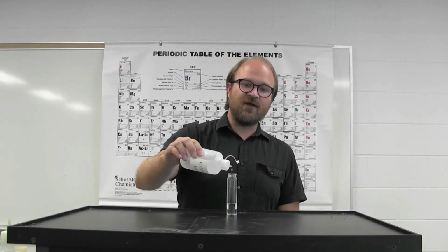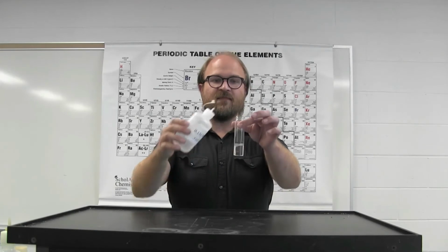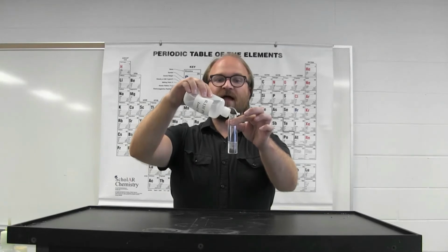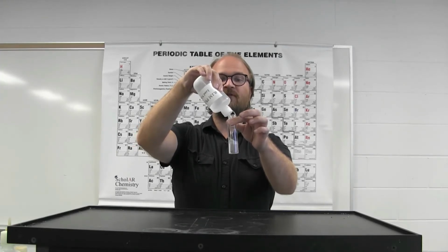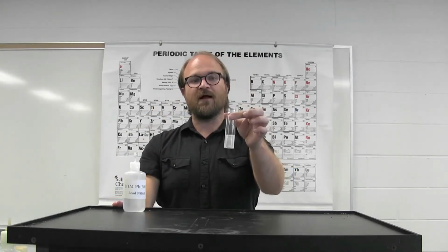At low concentrations, the precipitate forms and then quickly dissolves as it is below the solubility limit. However, at higher concentrations, the precipitate stays for longer and eventually becomes a fully cloudy solution as the limit has been reached for lead chloride.